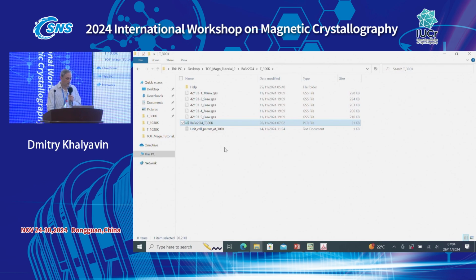No, you can, but it's not. Yeah, you can have a space, and anyways, there is an underscore here. It's just on the screen, it's not shown. Yeah, but I think you can, right, Ryan? It won't complain about the space. It doesn't like it. I know it doesn't like it, but.